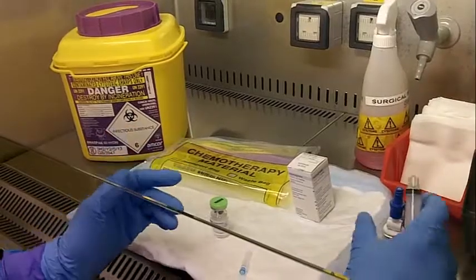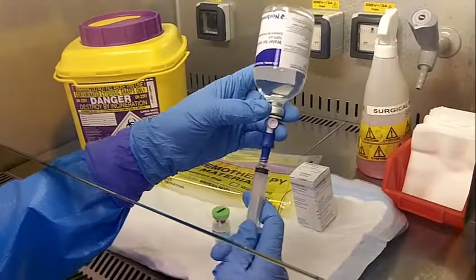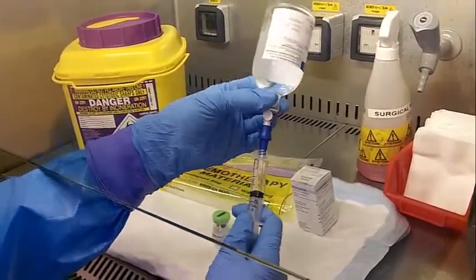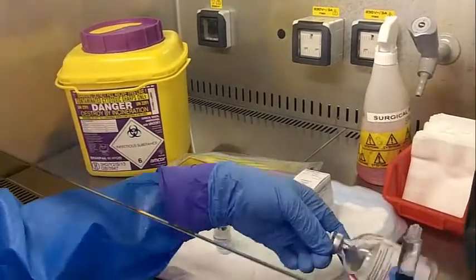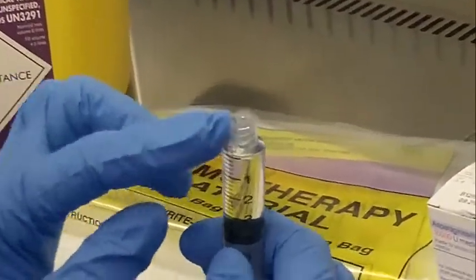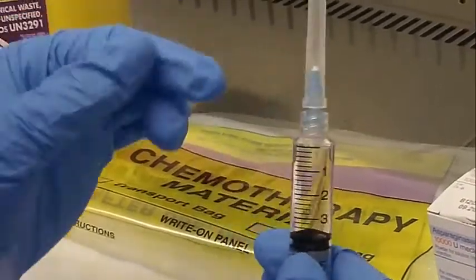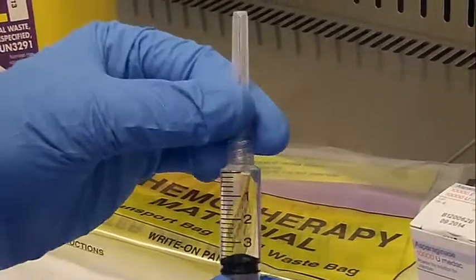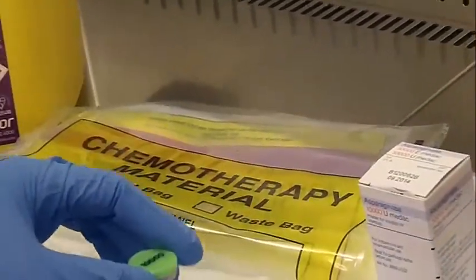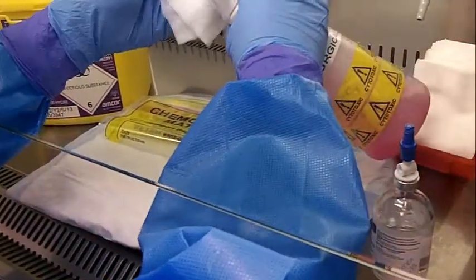So first of all, we need to get our water. I've just got a little spike in this just because we use it multiple times, but a needle will suffice. And you can see I'm using a Luer-Lock syringe, and it's important that you use these at all times, because it's just an extra safety feature. When we screw that needle in place, it's not going to pull off. So when you're injecting the animal, if they move, that bit's not going to come detached. So you want to get a swab with some alcohol on it.